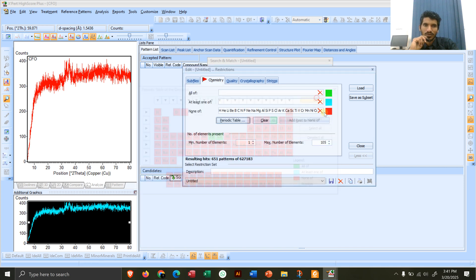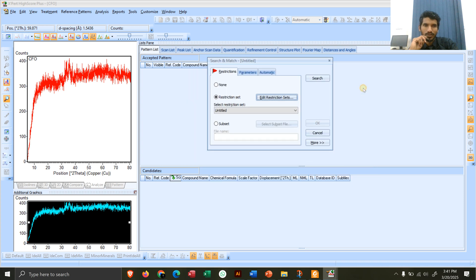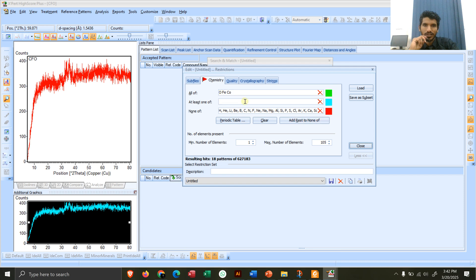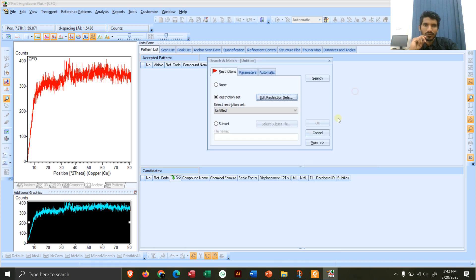Press OK, then go back to Edit Restriction Set. Click 'Add Rest to None', then click Load, then click Search.